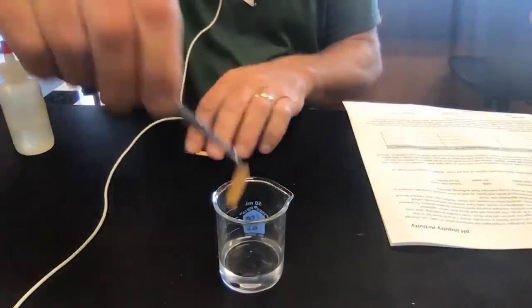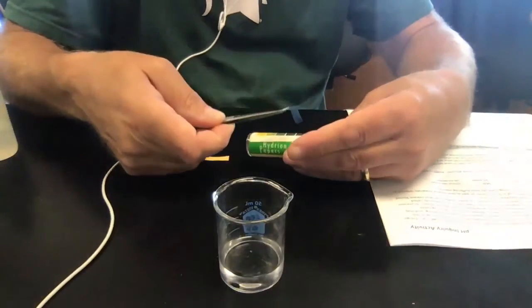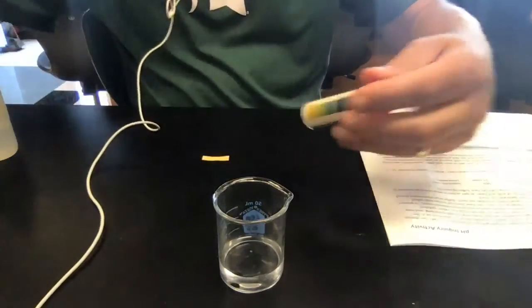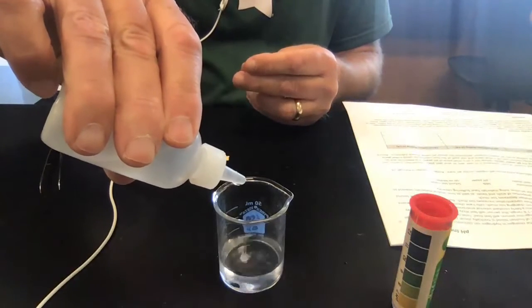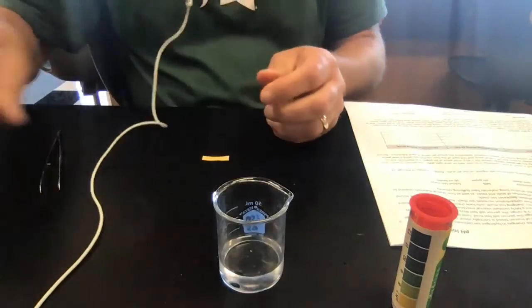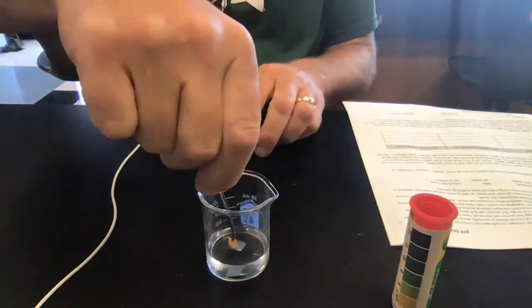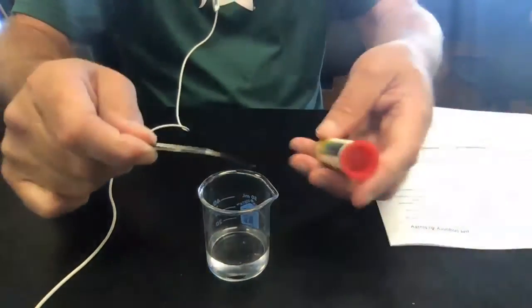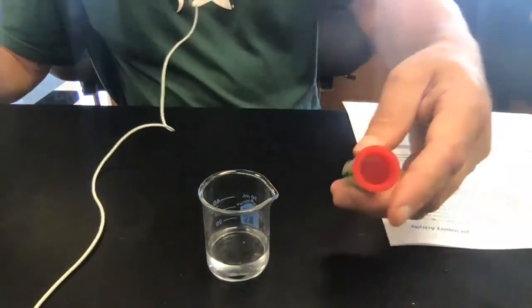And so now this is 20 drops. And you can clearly see it's coming out quite blue. I would say that's at 11. And finally, 10 more drops. Total of 30 drops now. Swirl it around. Take it out, even a darker blue, and that is up into the 12 range. So 7 to 10 to 11 to 12.